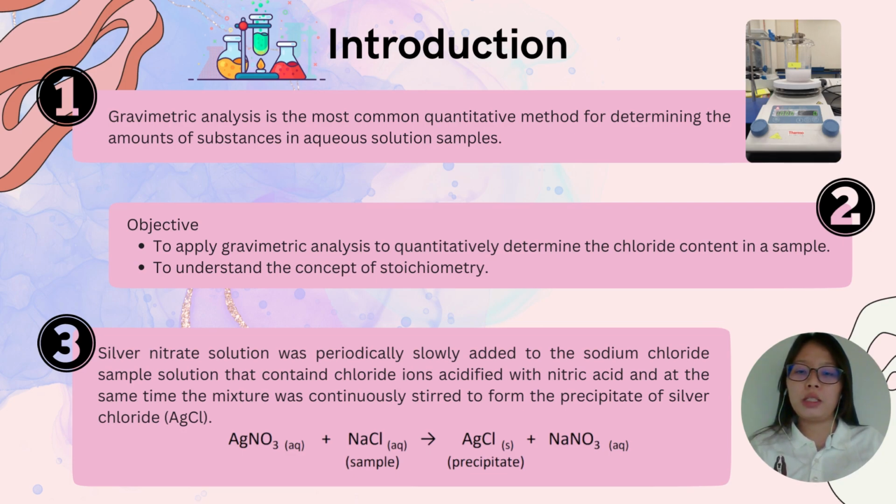Today I'm going to present the introduction. This experiment is about using gravimetric analysis to determine the chloride ion in a soluble sample. So what is gravimetric analysis?